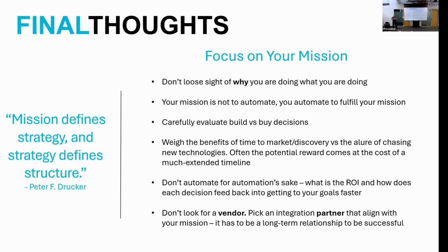But in summary, I wanted to take a step back. As I talked about your automation strategy and how you approach automation, there's often this real tendency to dive right in. I've been in lab automation for a long time now and built a lot of systems, and I find myself reflecting sometimes how often I tell people don't automate yet, right? Don't jump in and follow a technology because it's exciting.